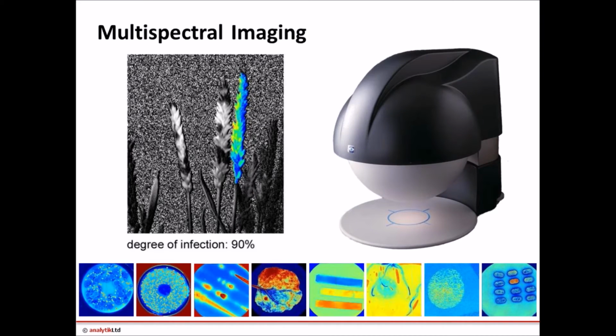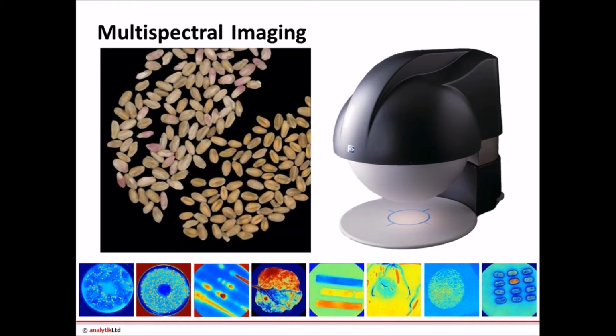And to take it back to the example I showed you earlier of fusarium infection on a wheat ear, we can actually do this same thing with the VideometerLab. That's just a multispectral imaging system. It only has 19 data points in each spectrum.